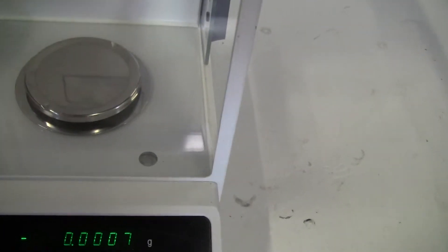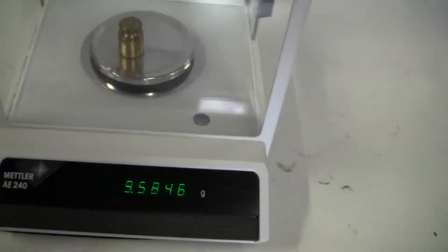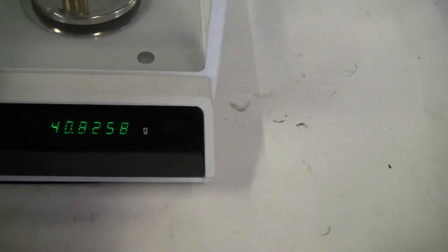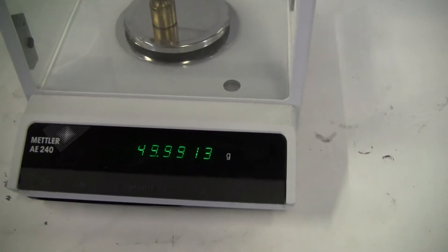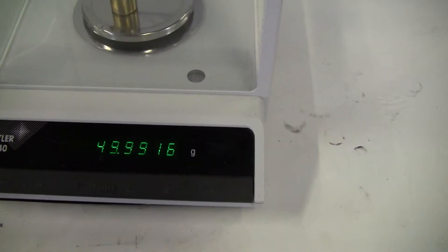Put some weight on it. 50 gram weight. Needs to be calibrated a little bit.